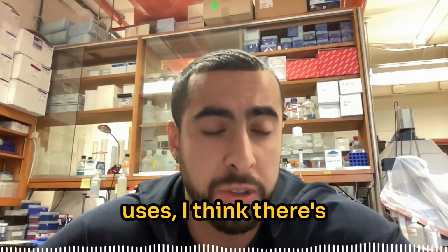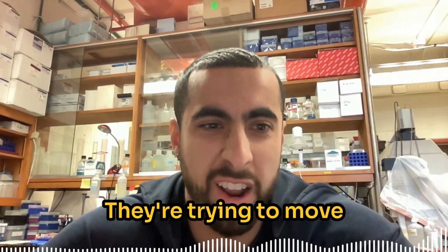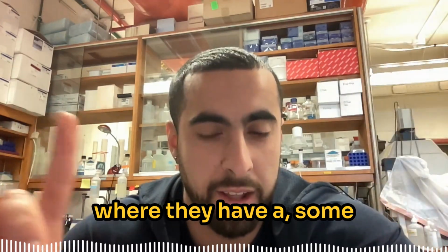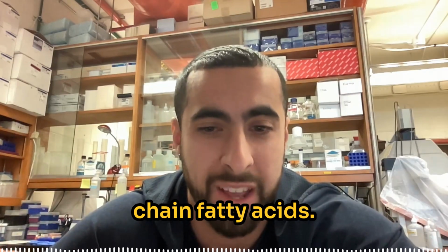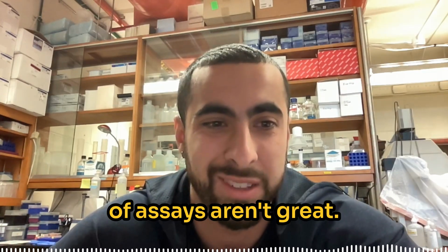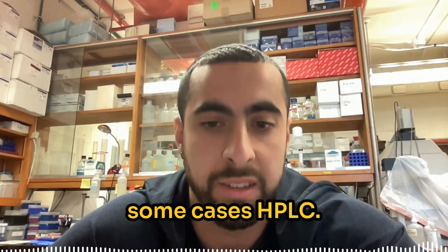The literature also uses, I think there's new methods. You could use HPLC, liquid chromatography as well. They're trying to move toward a type of assay where they have some sort of conjugated, not antibody per se, but something that could bind to short chain fatty acids, but the sensitivity and the accuracy of this type of assays aren't great. So traditionally, it's been GC-MS or in some cases HPLC.